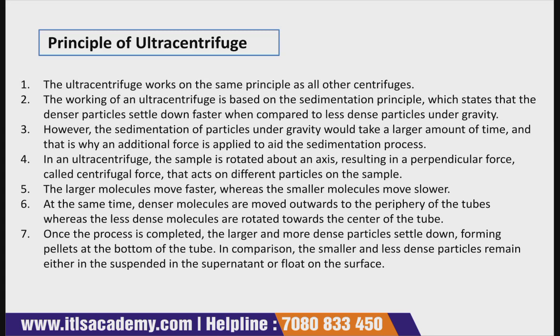So in short, centrifugation works basically on the sedimentation principle, and the working of ultracentrifugation is the same, where the denser particles settle down faster when compared to the less dense particles under gravity. So this is the principle of the ultracentrifuge.